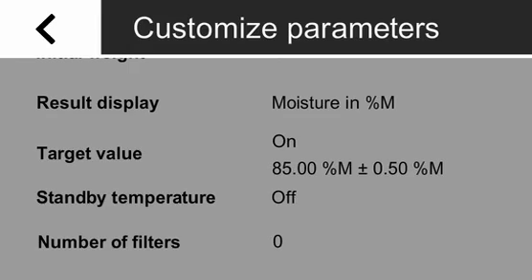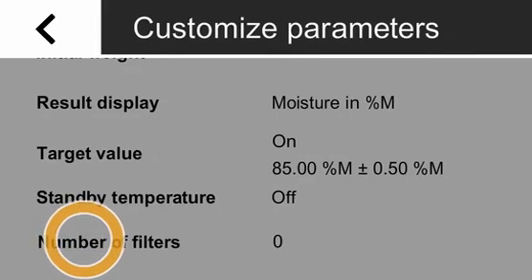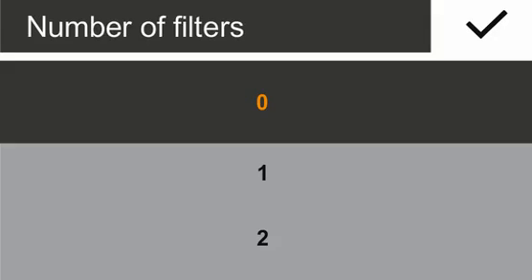To include the weight of the glass fiber filters into the measurement, select Number of Filters. For the analysis of ketchup, you need two filters.